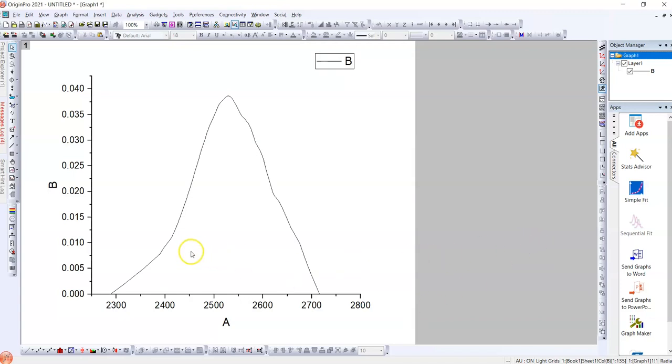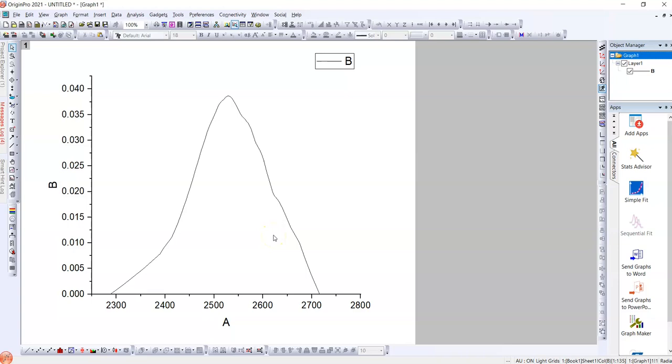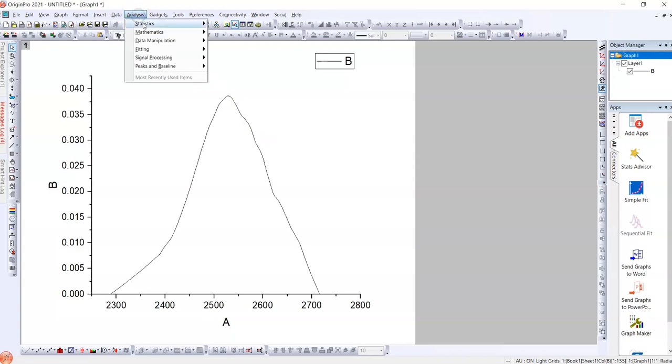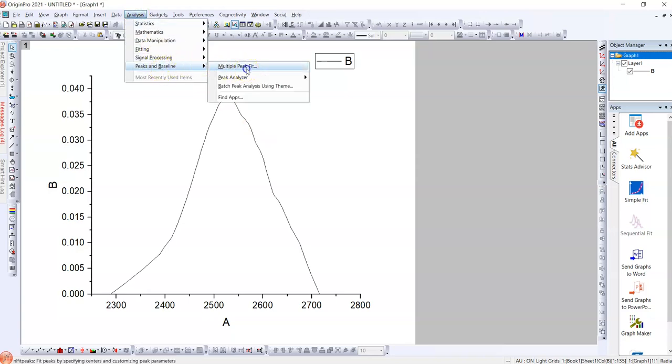This is imperative that three cumulative peaks - at least three peaks: one is here, one is here, one is here. This is assembled and all these peaks give us this total whole spectra. Right now, how can we distinguish the individual spectra from this curve?